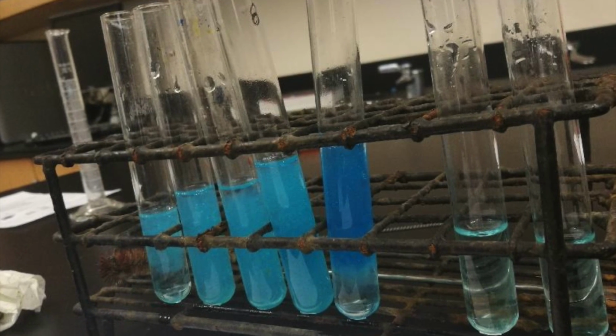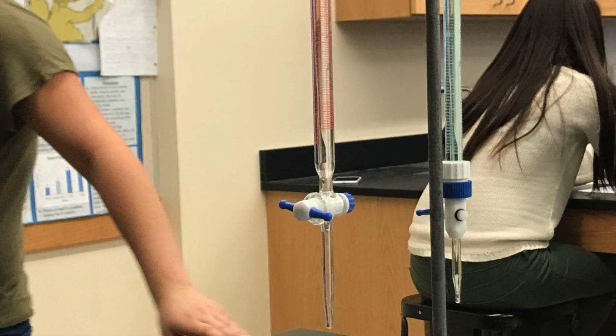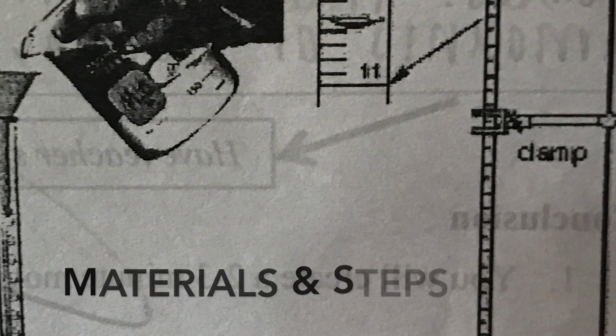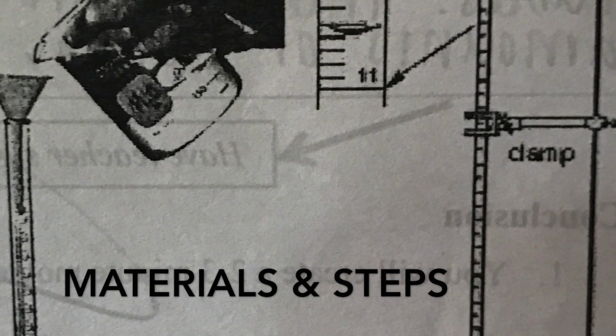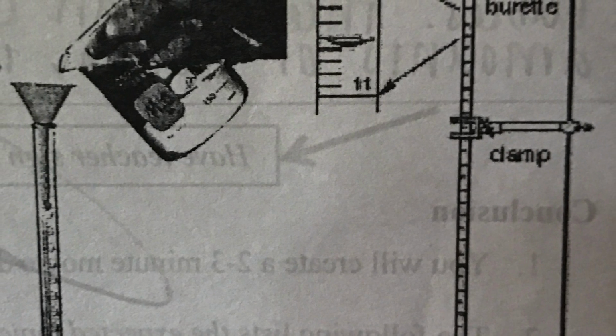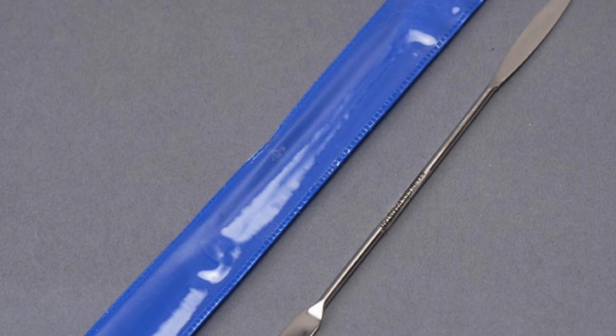Throughout the lab, our purpose was to observe the reaction between potassium hydroxide and copper sulfate in different mole ratios, then measure the precipitate in order to find the limiting reactant of each test tube. The materials we used were 0.2 molarity of potassium hydroxide, 0.1 molarity of copper sulfate, a burette, 8 test tubes, water, a spatula, and a beaker.